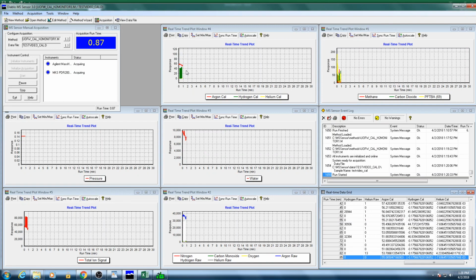So we did have some technical difficulties in running that last scan, but if we wanted to, we could run a second set of calibrations. But it seems to be sort of correcting itself as we let it run a little longer. Yeah, and so now that we've let it run a little longer, we can see that the values are a little closer to what we had anticipated. But again, if we would like, we could run another calibration.